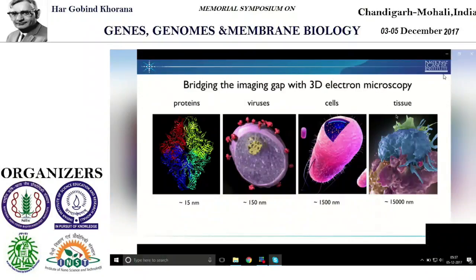On the last slide, I'd like to point out that cryo-EM is a broad discipline, and my own interest in this technology has been to bridge the gap, not just to look at proteins, but to look at viruses. Nearly half the work we've done in the last decade has been on HIV, leading to the first structure of the primary envelope glycoprotein, template of vaccine design. We've reported over 100 structures of HIV, influenza, and Ebola glycoproteins using a closely related method called electron tomography. We've looked at structures of whole cells, bacteria in the context of signal transduction, chemotaxis in particular.